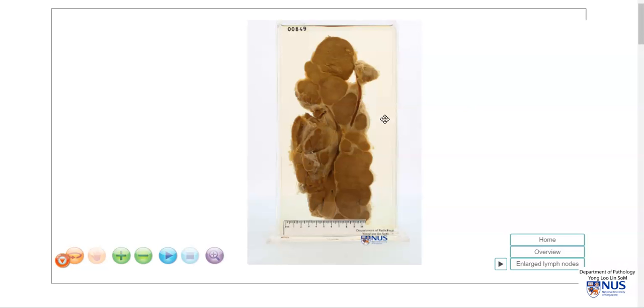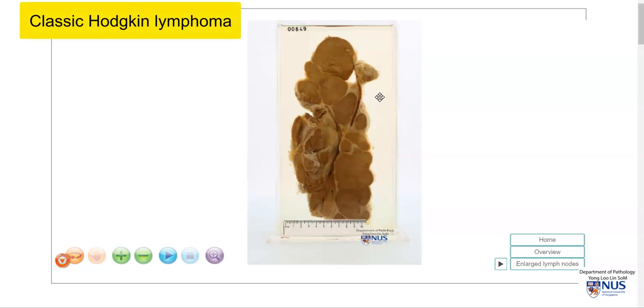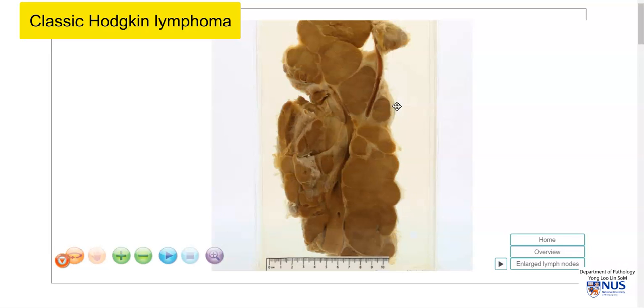This is a virtual pathology specimen of a case of classic Hodgkin lymphoma, and we can see here a mass of very large lymph nodes.